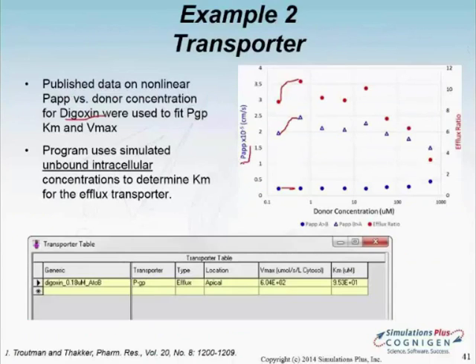The first question is, how well could we use MembranePlus to check the permeability of an active drug which is encapsulated in a nano delivery system? That may be a little bit more difficult. The system that we have, MembranePlus, is right now targeted really at looking at the permeability of the API alone.